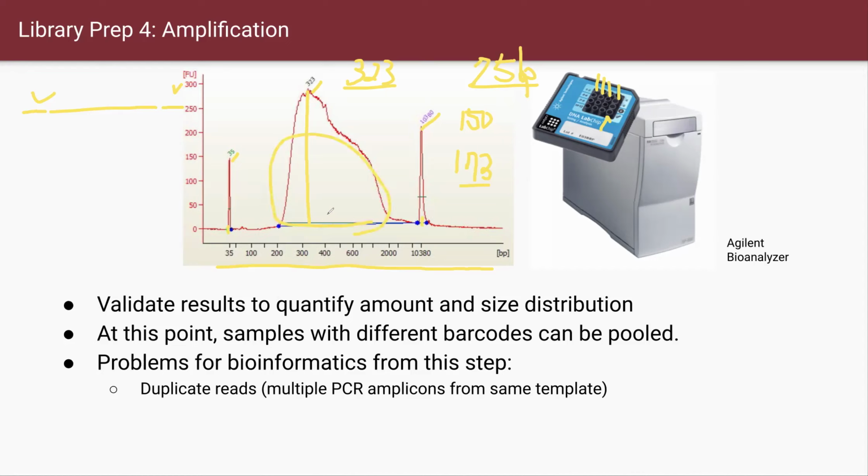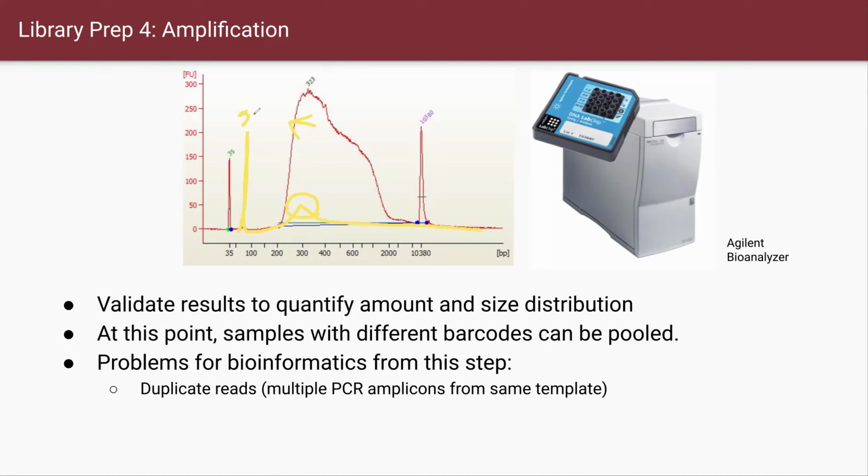If the PCR is not working correctly, and if the adapter ligation is not working correctly, then you're going to have information like this. So at 75, you have the sharp peak, and you have red numbers on here, right? Because these samples are not ligated, so this is shorter than that. Then 75 base pair, sharp peaks on here, because the adapters, they form much of that because they fail to ligate to the fragment. So they exist alone. Okay, so we can check whether the amplification or the library preparation was done correctly or not. So this is the thing.